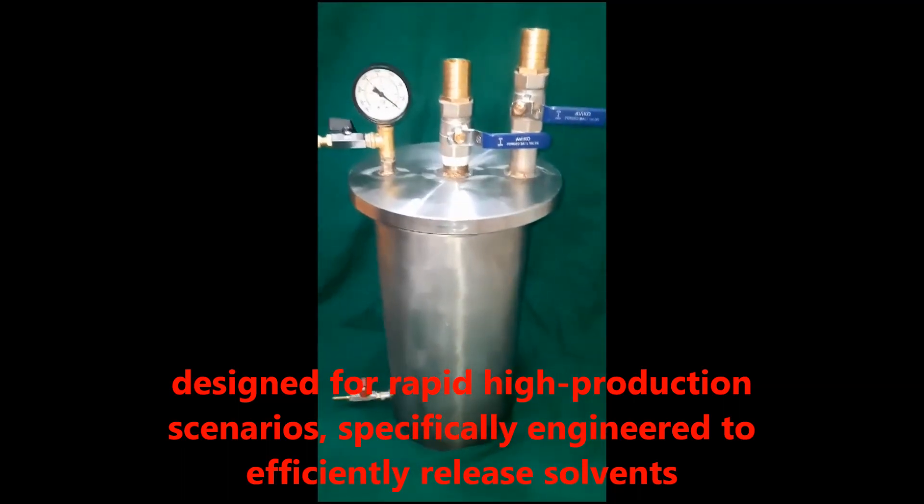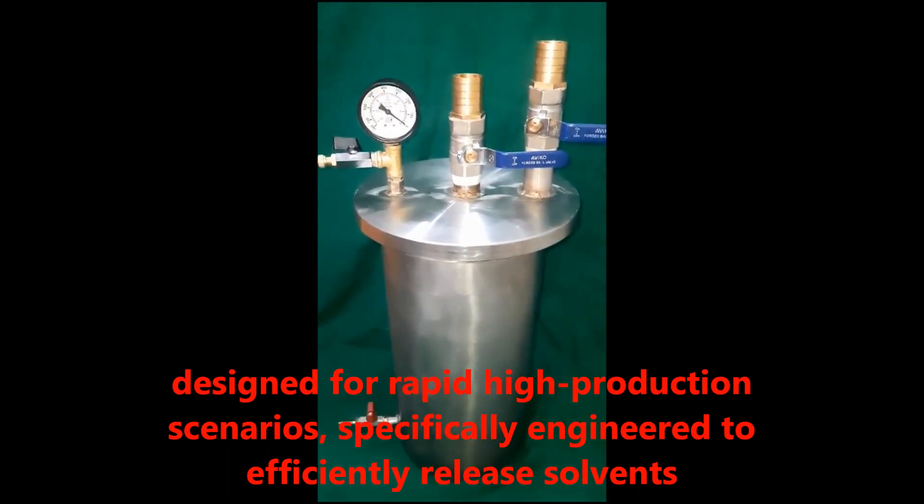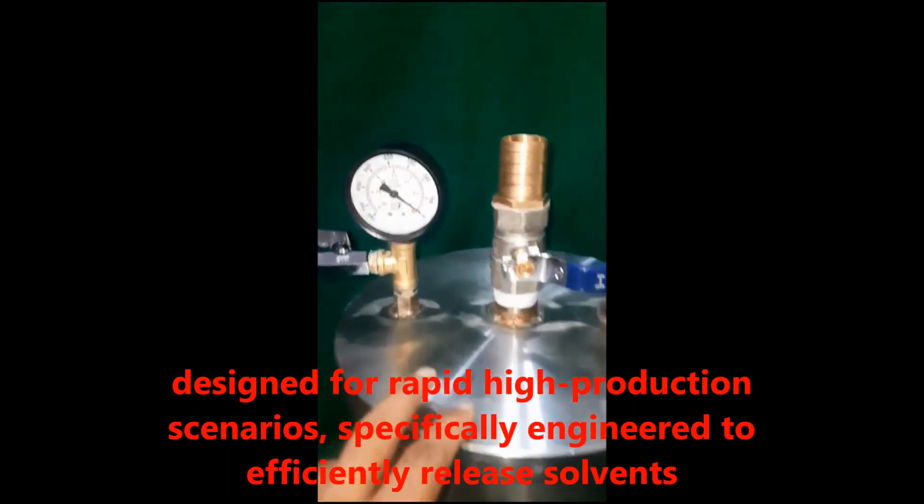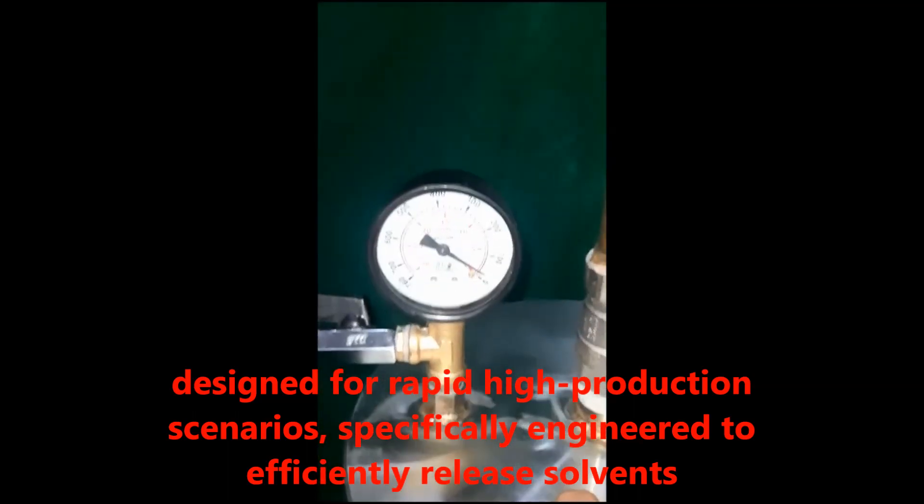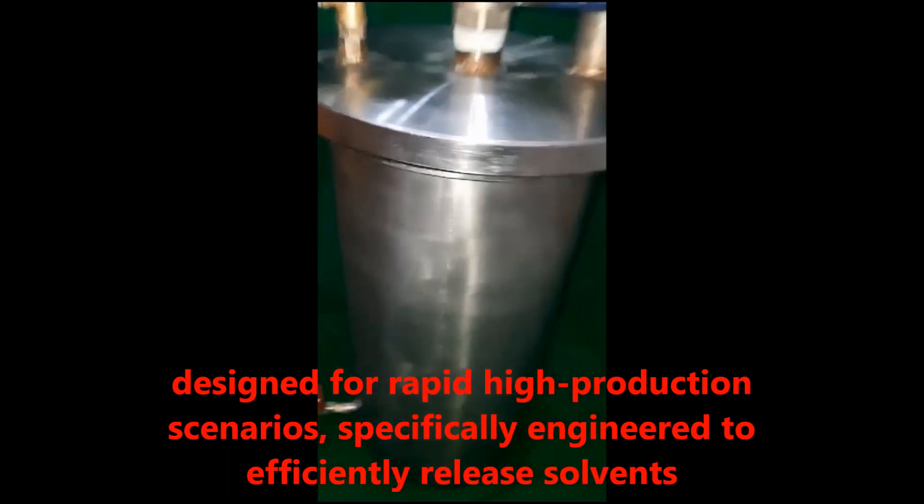This meticulously crafted trap holds ample capacity and features two generously sized AF25 inlet and outlet valves, seamlessly integrating with various vacuum pumps and allowing for adaptable fittings based on specific requirements.